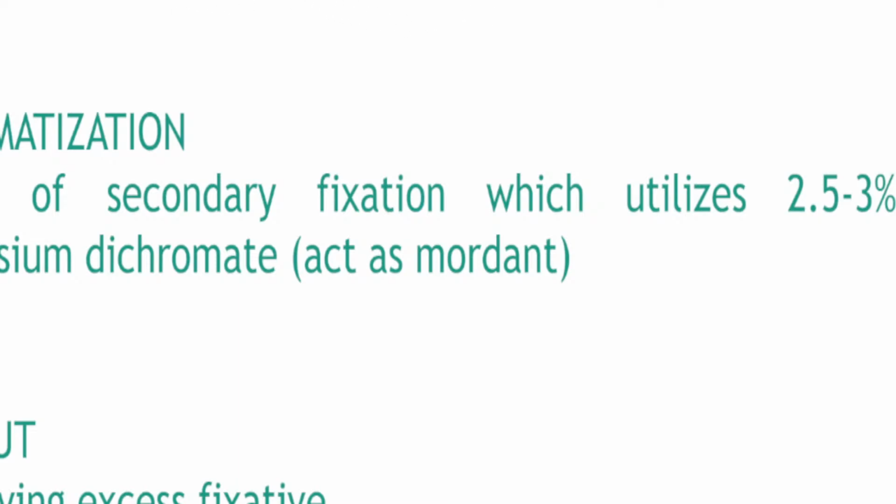Okay, so just important things to remember: secondary fixation, placing an already fixed tissue in a second fixative. This is basically when you say already fixed tissue, you either add it in a glacial acetic acid solution and then you add it into its permanent home, so to speak. Or bringing or removing it from pre-soak.